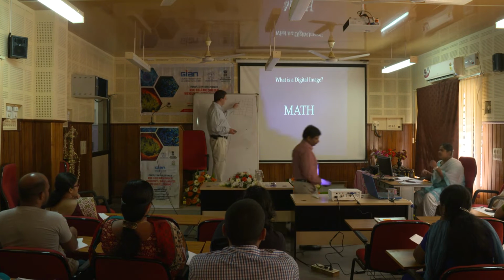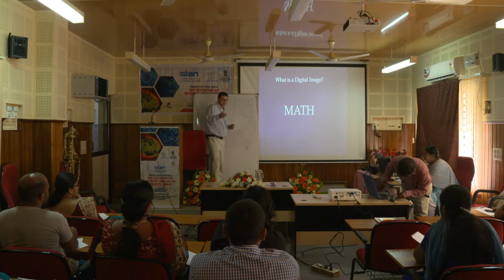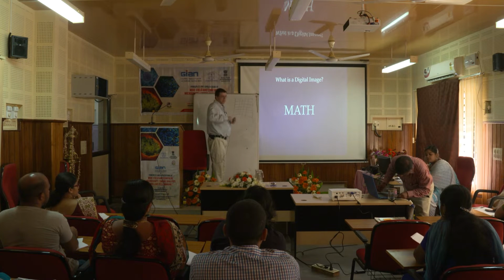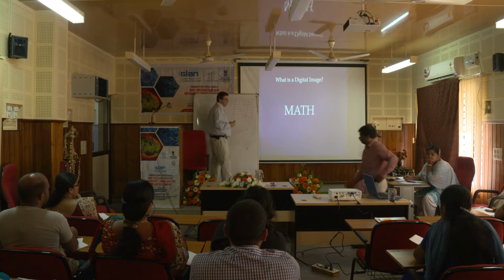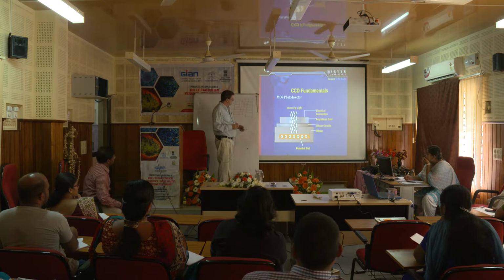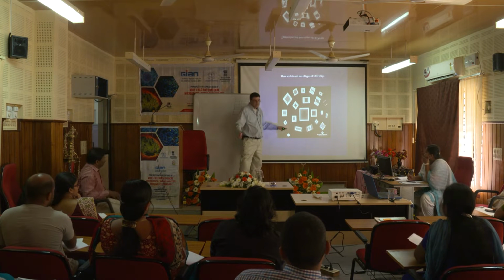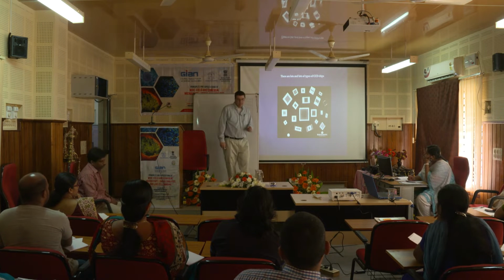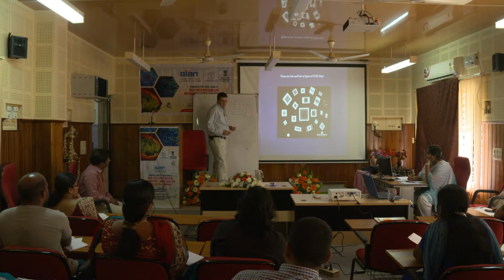pixels, right, and this is basically a schematic of the chip. So what happens is photons of light, different energies, different wavelengths, whatever, come in and hit these pixels, okay? And then the way a digital image works, let's go back one. You have different kinds of CCD chips, like different phones have different ones, the scientific cameras we use have different chips, but in general, they're all like this. They're all basically just a bunch of pixels, okay?